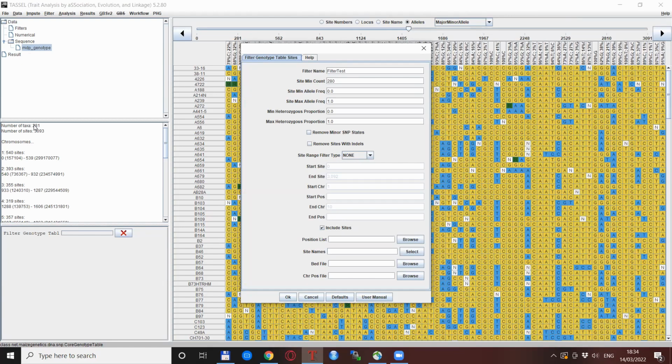So let's say that we want to say that a maximum of 10% of the SNPs would be missing. That would be kind of a default value that I normally use. So let's say that we allow maximally 28 SNPs missing. That would be just 10% of this 281. And that means 281 minus 28, and that is 253. So this is how the missingness is solved.